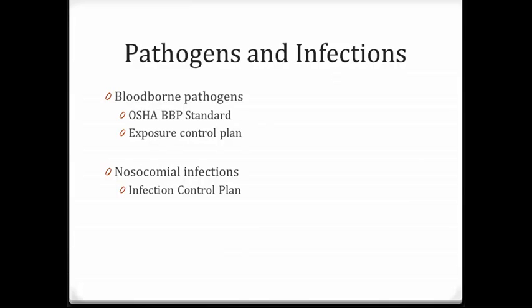Pathogens and infections. A bloodborne pathogen is any infectious microorganism present in the blood and other bodily fluids containing blood. Examples would be hepatitis A, B, C, D, or E; HIV; syphilis; and malaria — and there are many, many more. Those are just some examples.